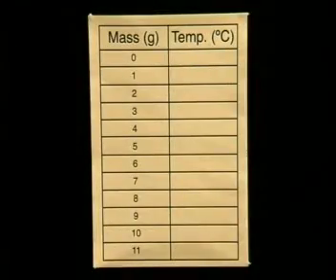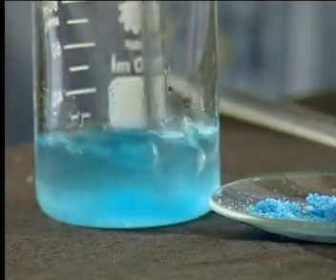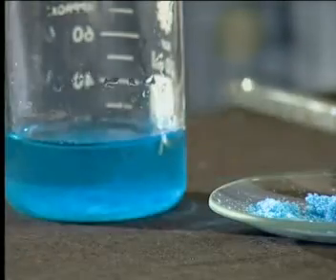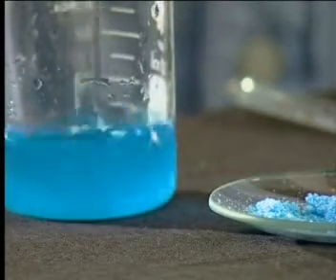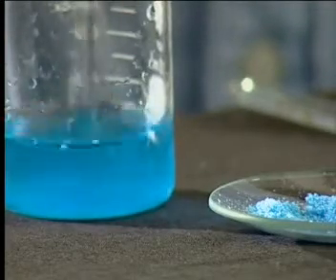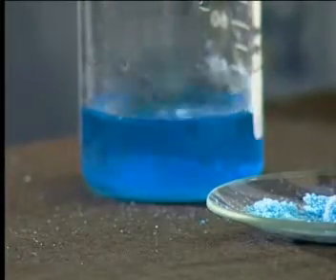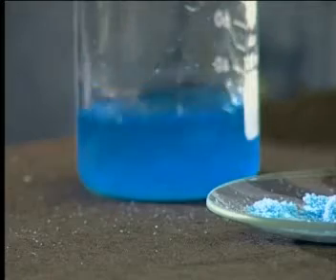As always, we need a table to record our results. Notice that the colour of the solvent changes when I add the solute to it. The blue solution formed is due to the presence of copper 2+ ions. We need to repeat the same procedure each time and make sure that the solute has dissolved completely before taking the temperature reading.